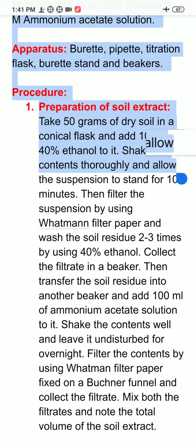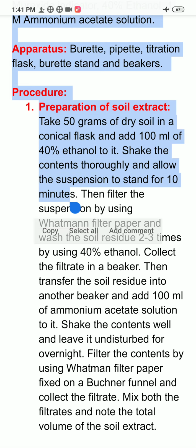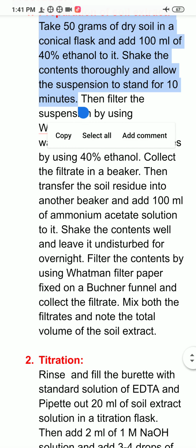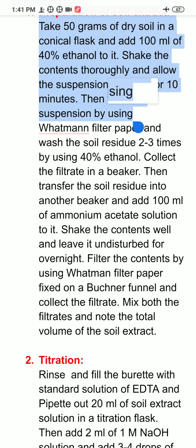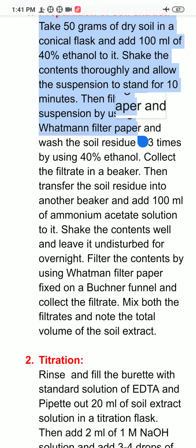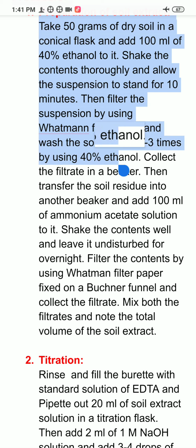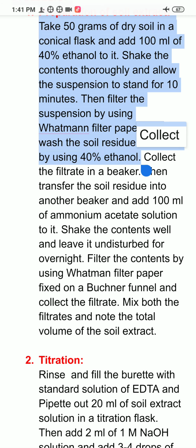Then we will shake the contents thoroughly to dissolve most of the part, and then we will allow the suspension to stand for 10 minutes, and after that filter the suspension by using Whatman filter paper and wash the soil residue, which is obtained on the Whatman filter paper, 2-3 times by using 40% ethanol.